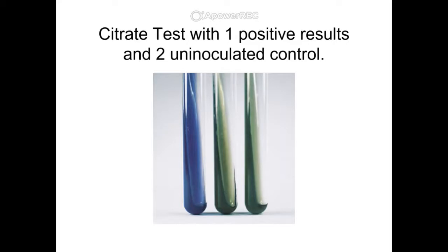So here is a citrate test example. It has one positive result and two uninoculated controls.